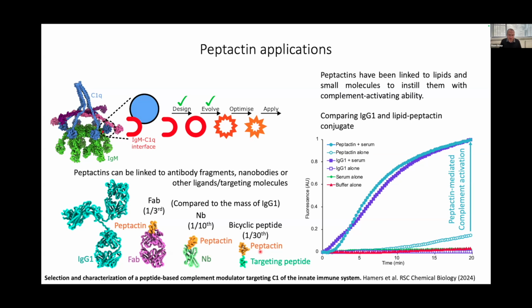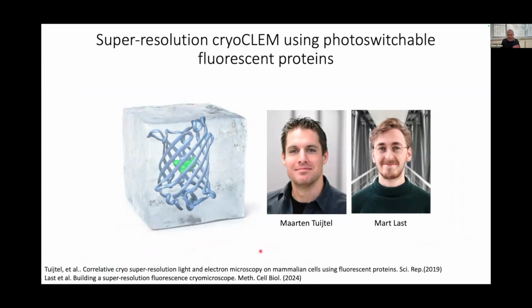So we've got some ideas and we're working through these now, but the point is all of these were made possible only when we imaged these molecules in their native state. And so for the last 5 to 10 minutes or so, I'm sure someone will yell if I start to overrun, I thought I'd talk about how we're moving towards doing it all in situ. So hopefully I've convinced you that imaging proteins in the native environment is essential for us to learn more about how complexes actually function. So obviously we want to move towards the most native type of systems we use, whole cells.